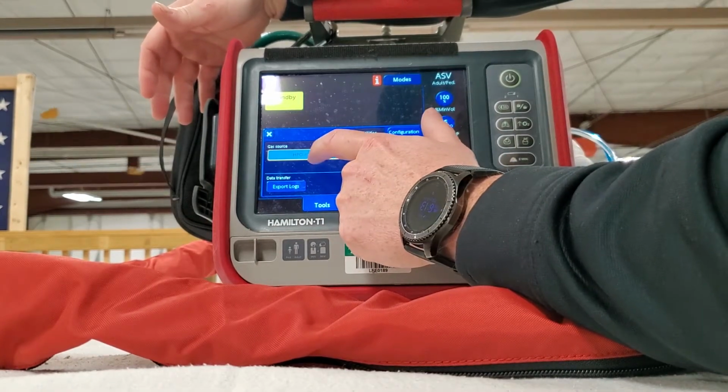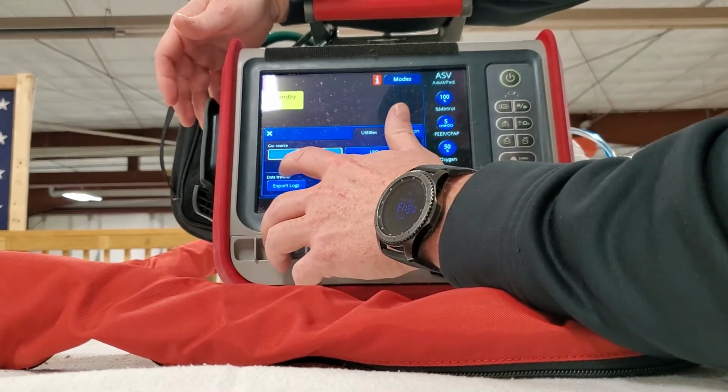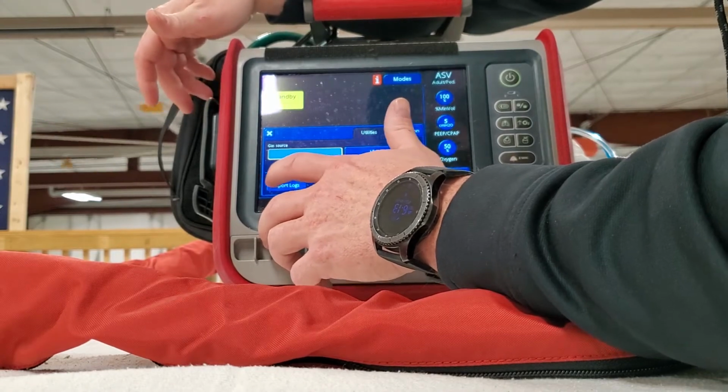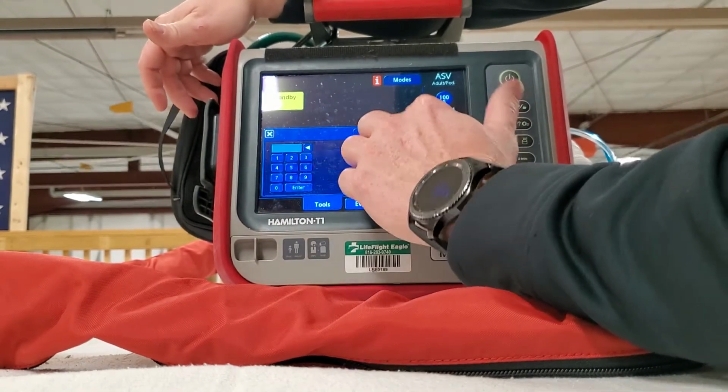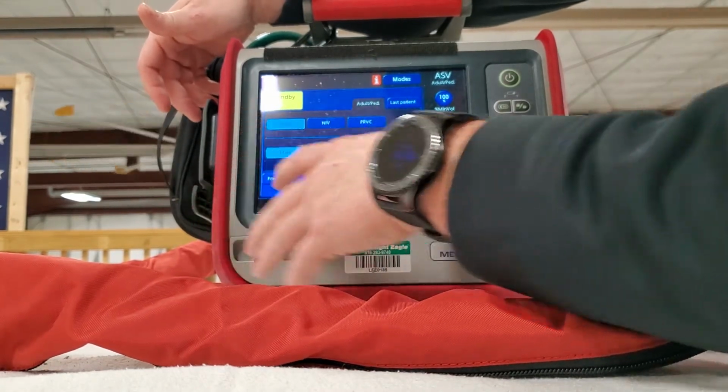But I feel like you probably leave it on high pressure output for the most part. And then if you wanted to transfer your data onto your hard drive, say, that's where you'd push this export logs button. Then configuration, that's a Hamilton administrator thing, so I don't worry about that.